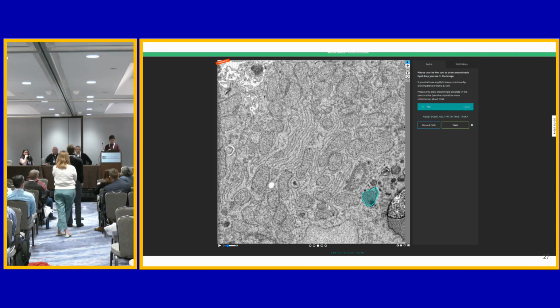What you usually do is take a model which has been trained on the same domain of images that you have, then provide it a number of examples, and at that point you would do fine-tuning, and that takes many fewer images. We're going more in that direction with foundational models and so on. You just retrain just the final bit.